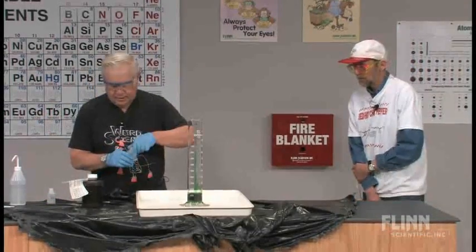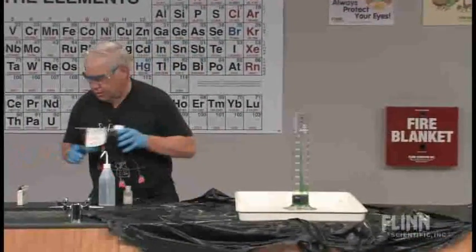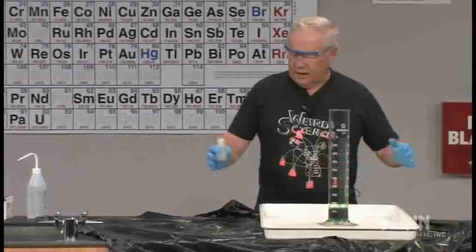So here we are. Let's shake that up some more, and now we are about ready to proceed. We'll get this stuff out of the way. We have a nice big tray that catches things.